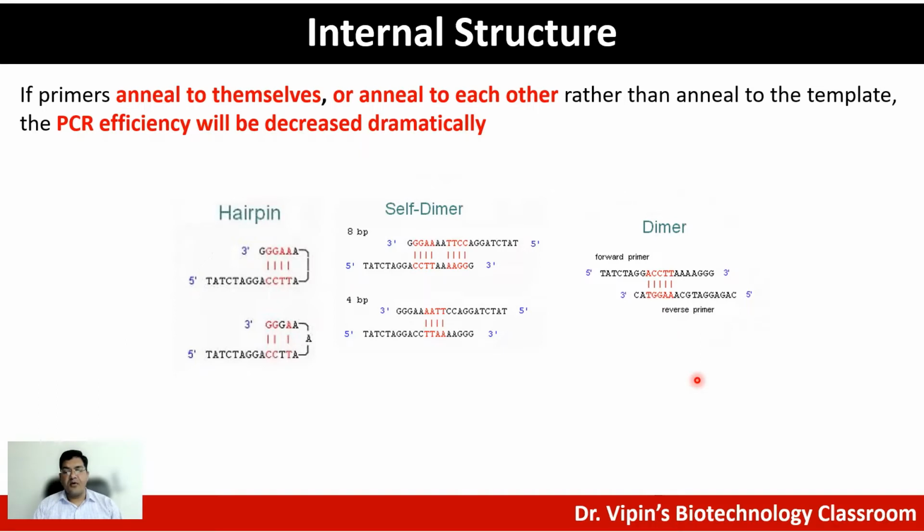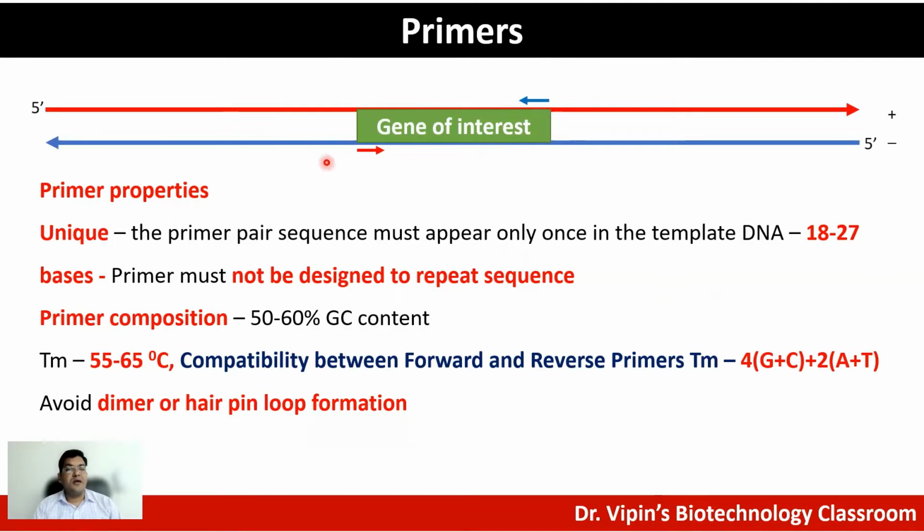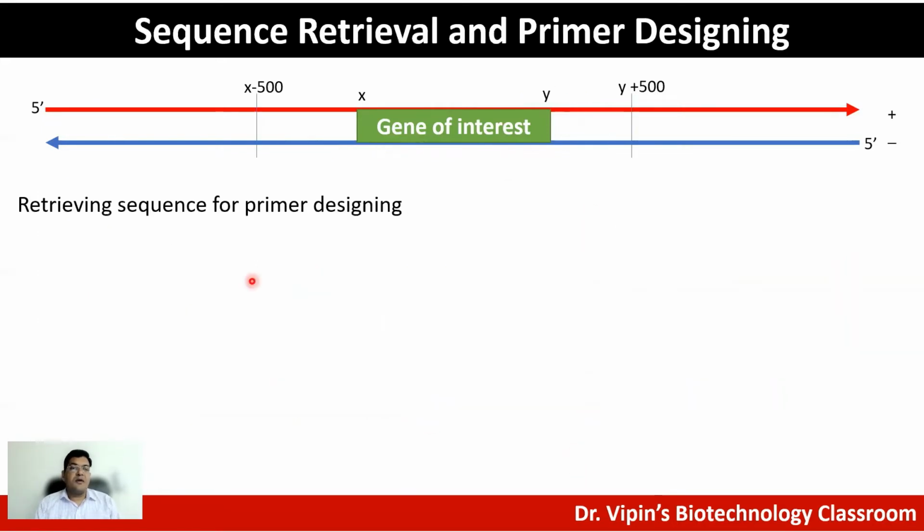So therefore, now if you look at the points one more time, many a times, instead of having absolutely ideal primer pairs amplifying exactly your target of interest, you may actually have to design primers slightly away from your start and end of the gene to get the amplification. This primer pair would be your primer of interest that satisfies all the conditions given here. So now let's have a context of things.